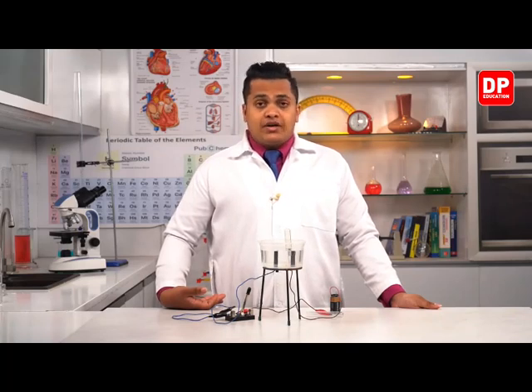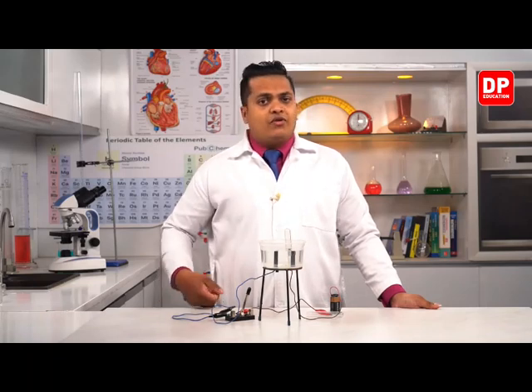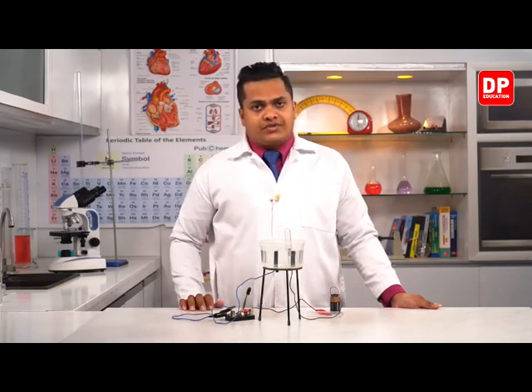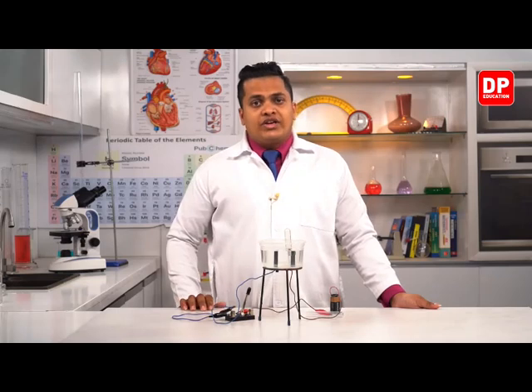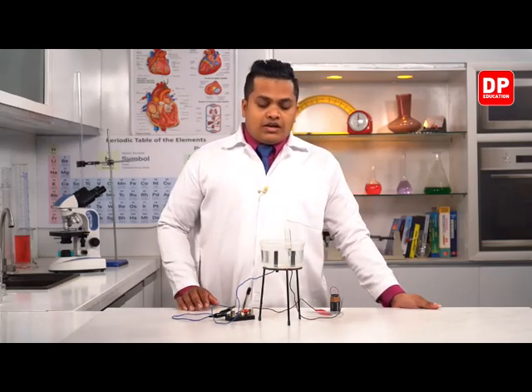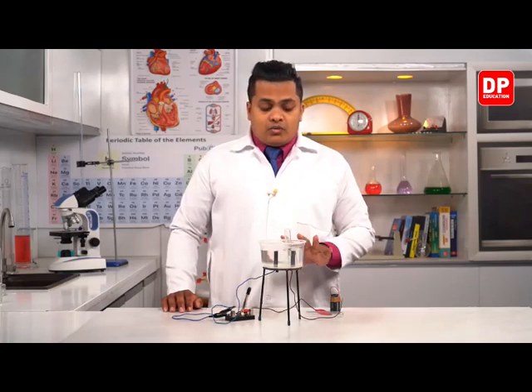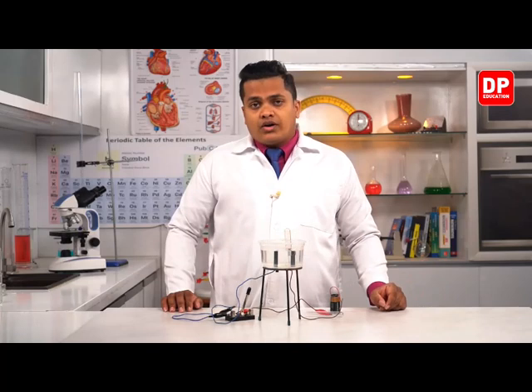Hydrogen is quite simple to collect. It's because hydrogen is a very lightweight gas. So unlike oxygen, it's not going to escape from a certain container, as it is always going upward, as it has very light weight. So my dear children, and there is another case. The other one is that now we kept this system for a very long time period.